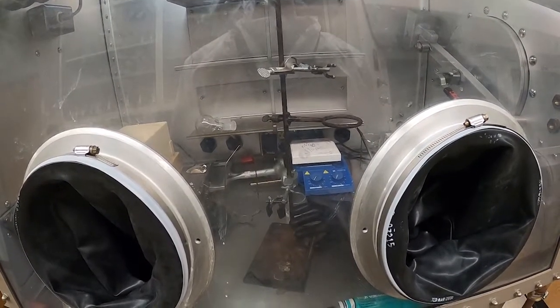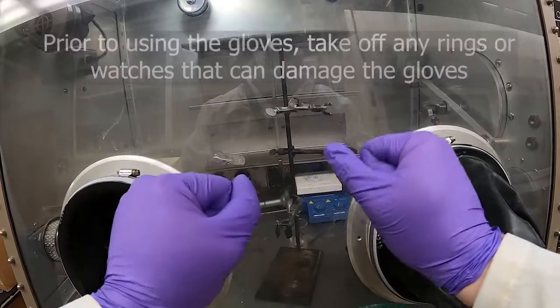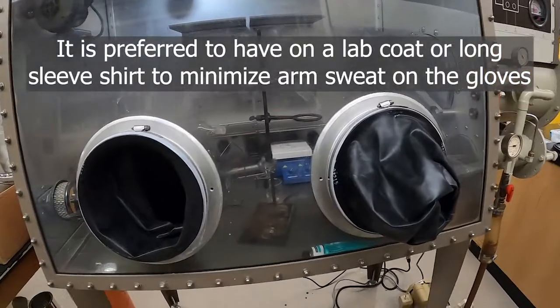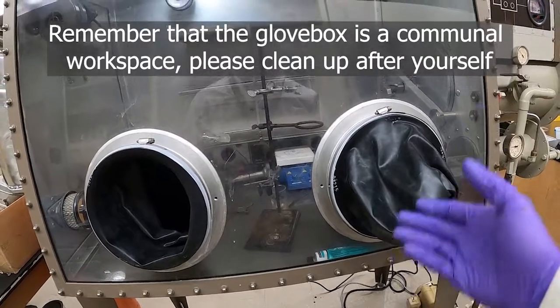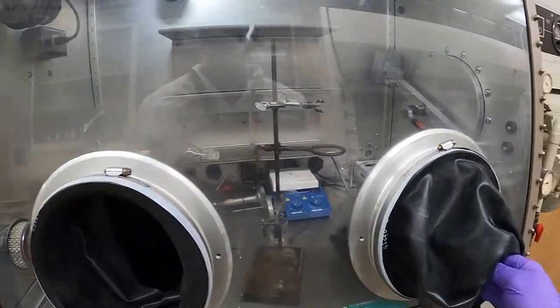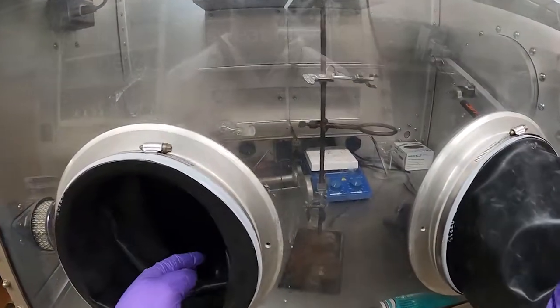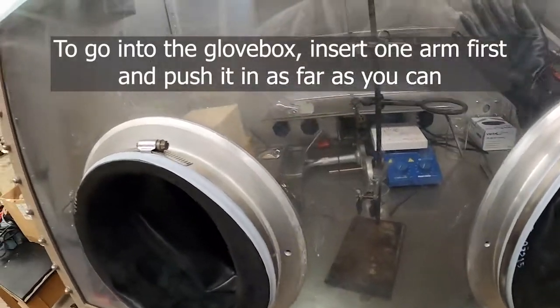Before you enter the glovebox to use the gloves, it's important that you take off any rings or watches you might be wearing, and have on a pair of clean gloves. It's preferable to wear a lab coat or some kind of long-sleeve shirt so that you don't get sweat from your arms on the inside of the gloves. This is a workspace that more than one person will probably be using, so if that does happen, clean the outsides of the gloves with a paper towel when you're done.